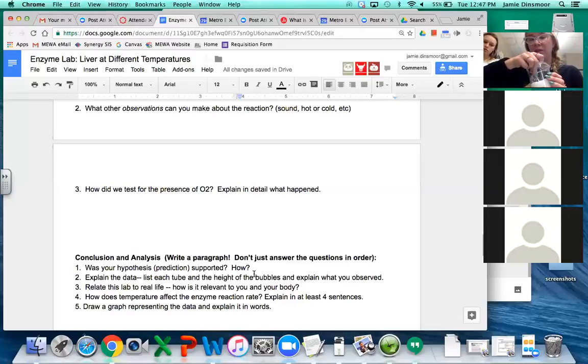Maybe it's burning out too fast. It keeps burning out really fast. There we go. Yay! Right when it goes, I was about to push it. Okay, it's doing it again. You can see it getting brighter. But you saw evidence. Okay, one more time, and then I promise we'll stop playing with the fire. It's fun. It is cool.